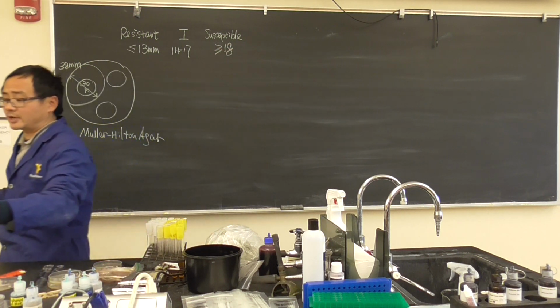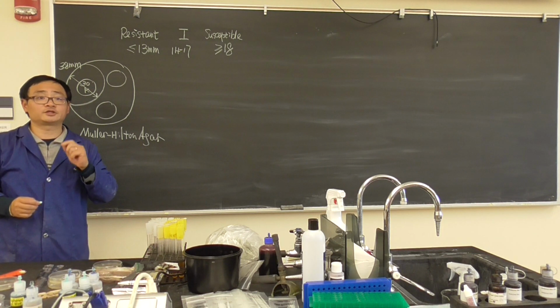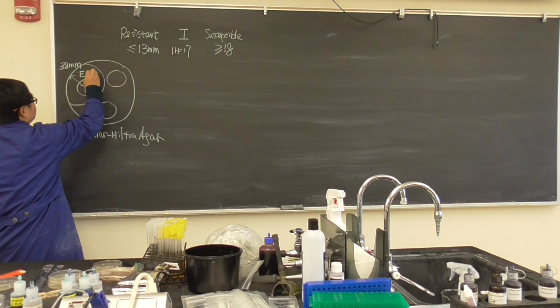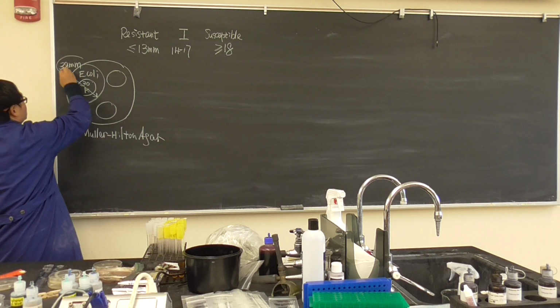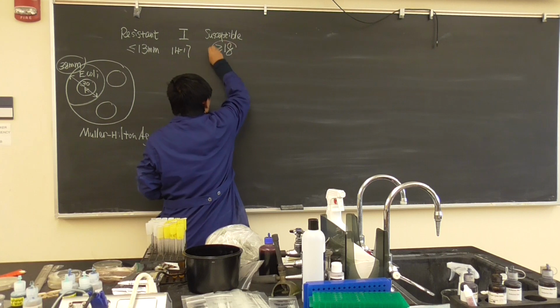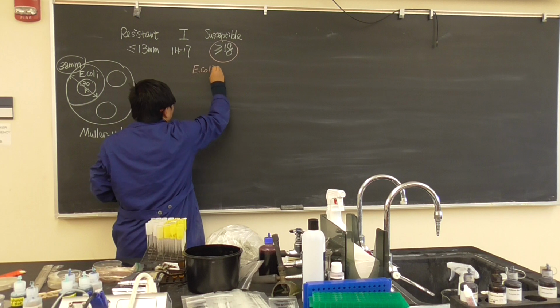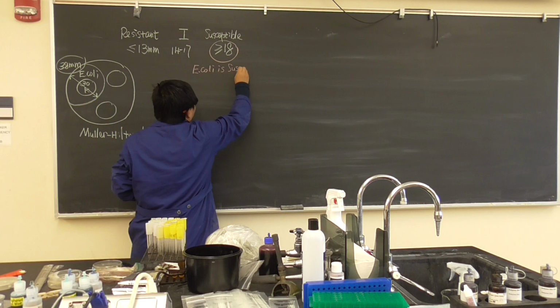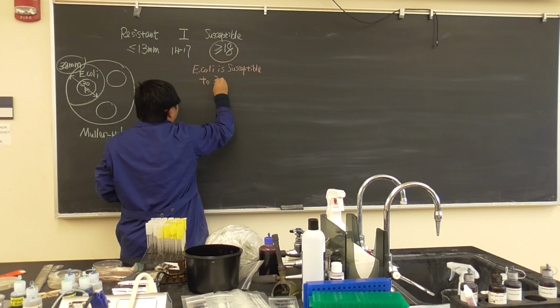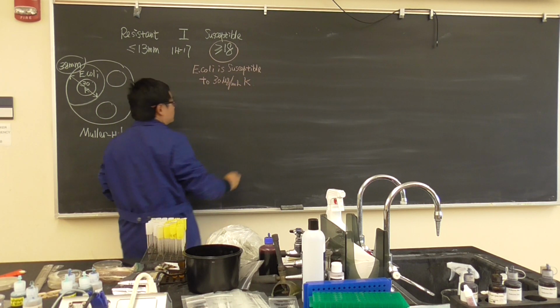So, what do you think of this bacteria? Which one is this? Did you label what the bacteria is? Susceptible. Oh, this is E. coli. Okay, so that is E. coli, let's say. Our inhibitory zone is 38 millimeters, which fits this category. So, what we will say is this E. coli is susceptible to 30 microgram per ml kanamycin.